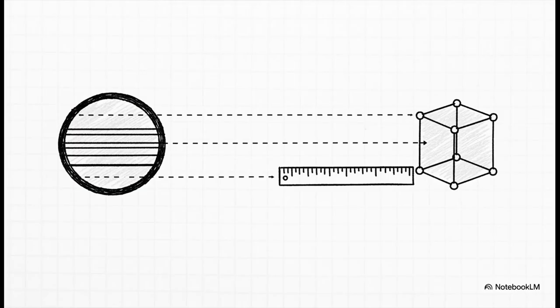The spacing between these layer lines is incredibly important. It basically acts like a ruler. It lets scientists directly measure the dimensions of the crystal's unit cell. And the unit cell is the basic repeating block that builds up the entire structure. This is how we get the blueprint.